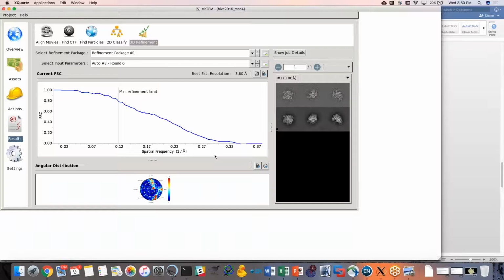What does this mean when they look like that? It probably gets lumped into this term called overfitting, which is just, yeah, we're over-parameterizing things, and this is not a particularly good refinement based on the shape of this curve.